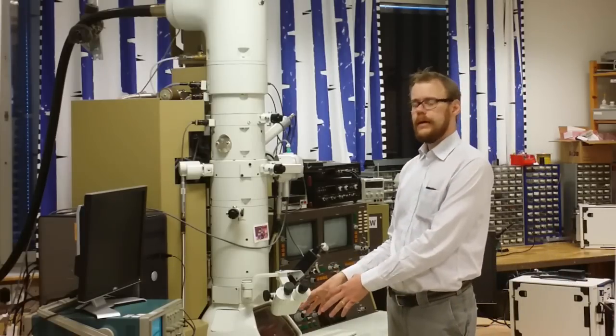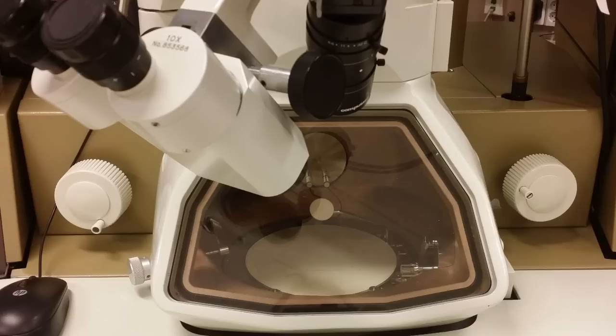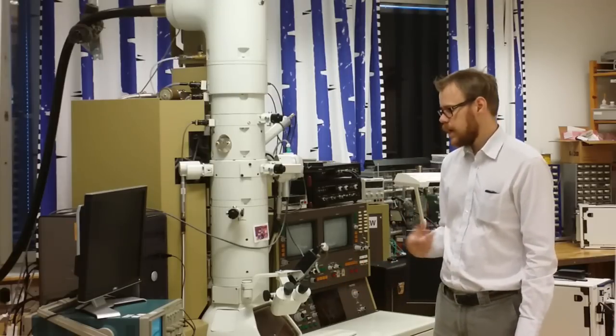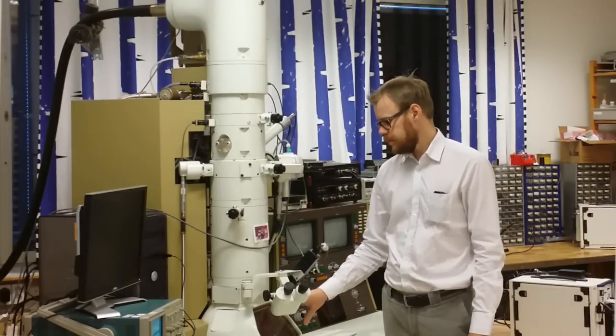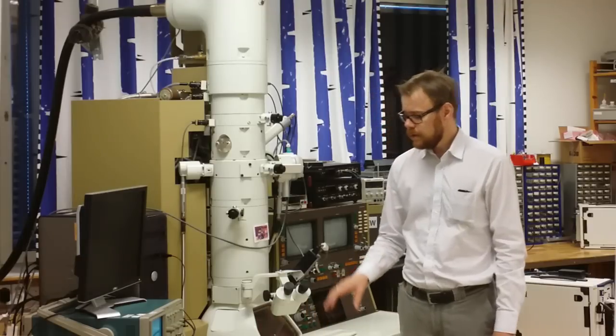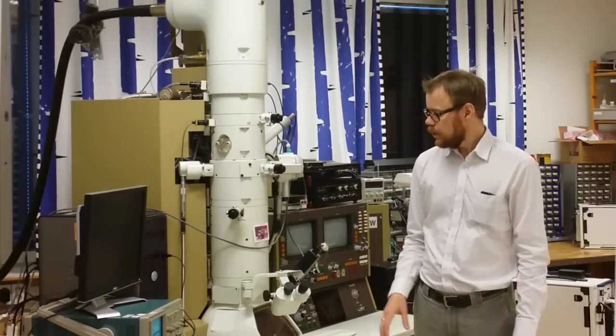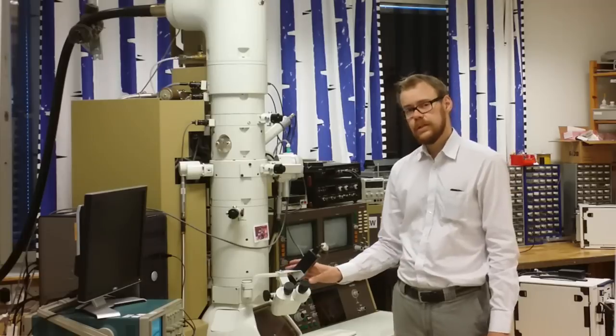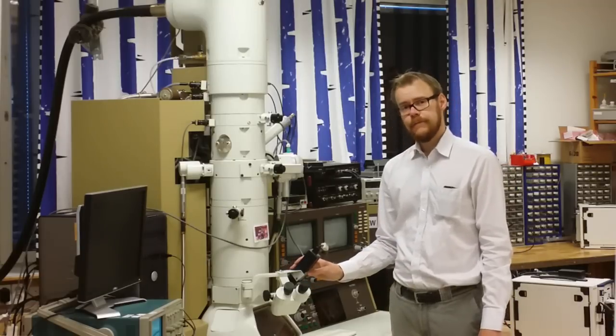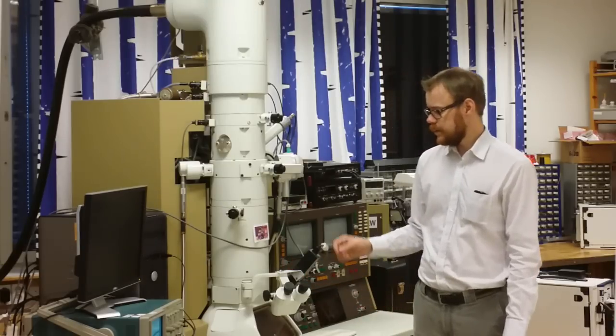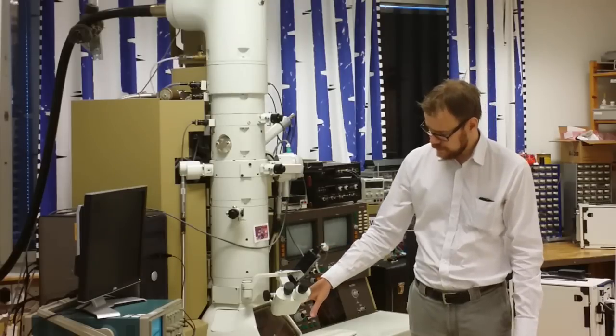At the bottom here you have the viewing screen. That is basically a fluorescent disc. So when an electron hits the dish it glows. And then you can see that with your eyes. So either you view this just by your eyes manually, or you use these binoculars, or perhaps the most common thing is to use a camera. Here we have a very simple camera that is just filming this fluorescent screen.